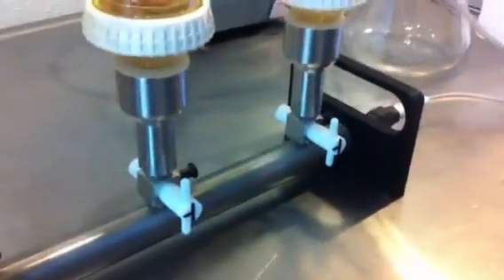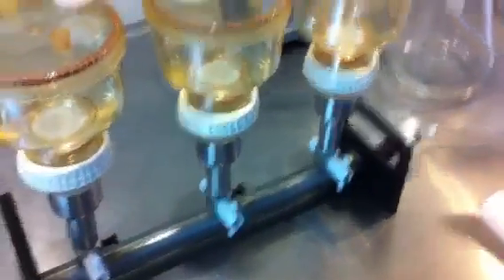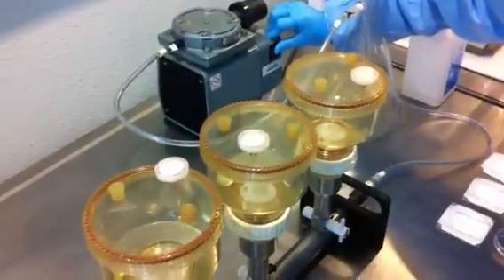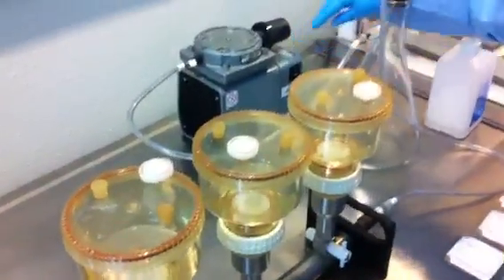The next step is to check to make sure the valves down here are in the right position. They look good, so we're going to turn on the pump. You can see it's being pulled through here, through the manifold, and into the receptacle.